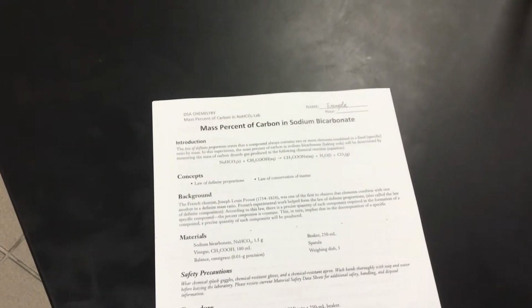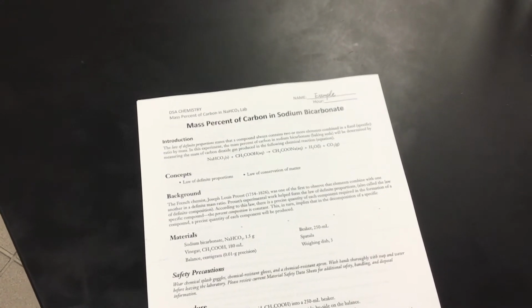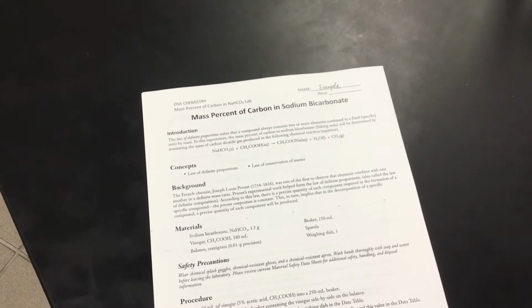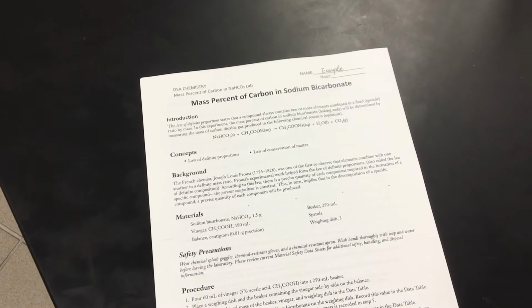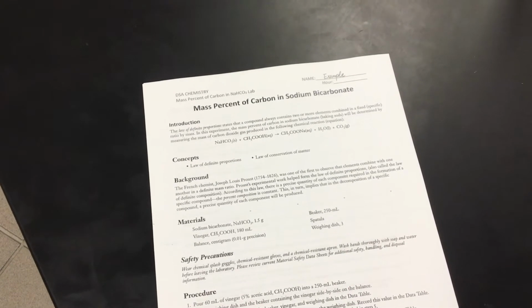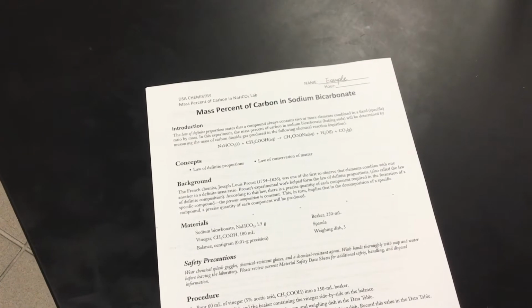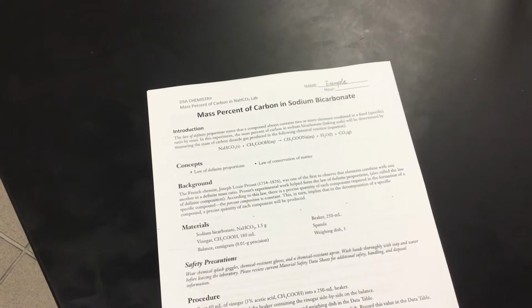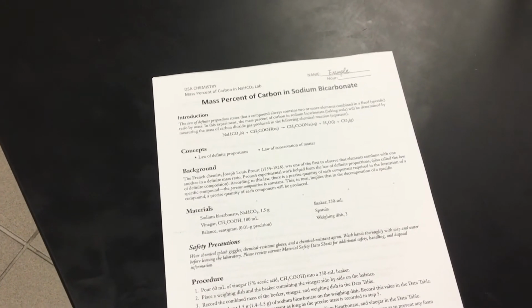Please read through the introduction. You need to really pay attention to the chemical equation. Although we haven't talked through chemical equations as much, in this one you can see sodium bicarbonate plus vinegar will give you sodium acetate and water and carbon dioxide. So read through the introduction, background, and procedure, and we'll get it started.